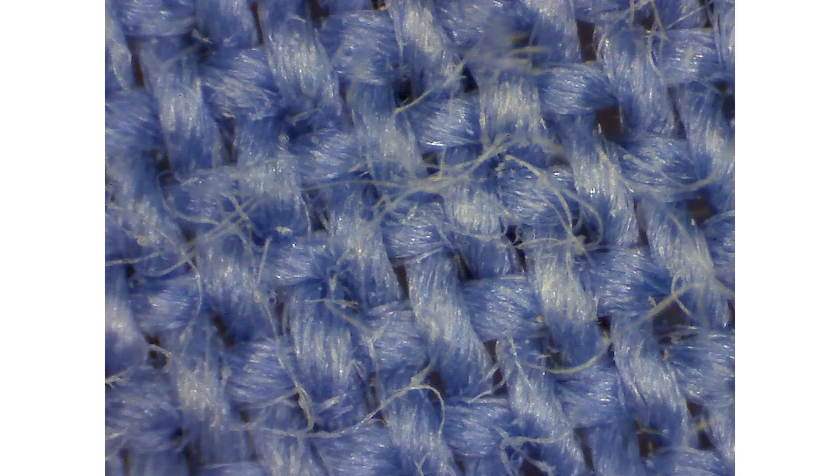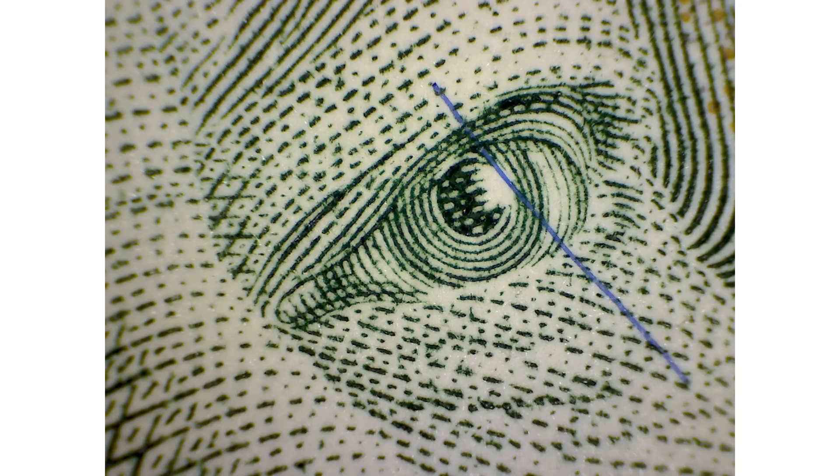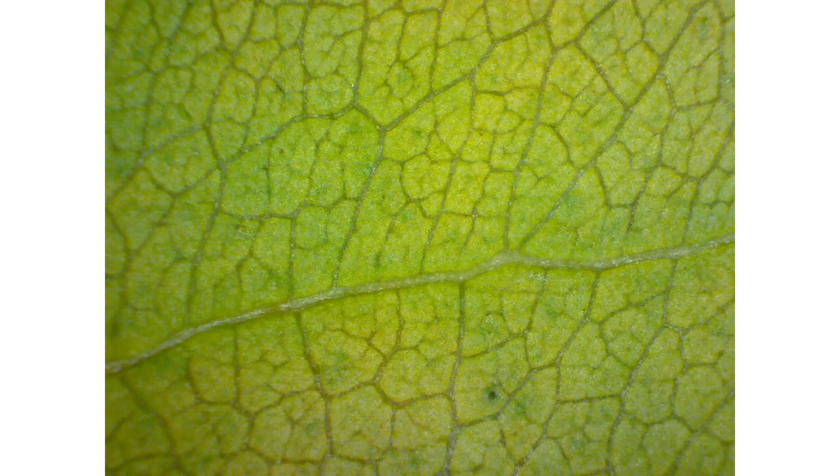And of course you can use the microscope for other stuff too. Here's a piece of fabric at 50 and 200x. Here are the tips of my tweezers, and some other metal surfaces too. Here's a $20 bill. And here's a close-up of a leaf.